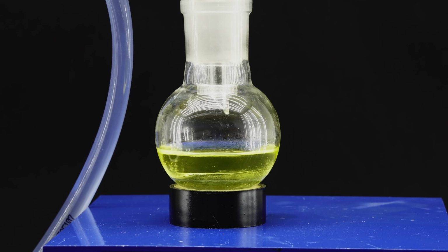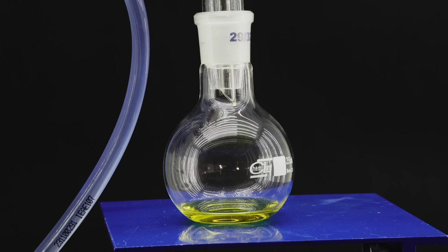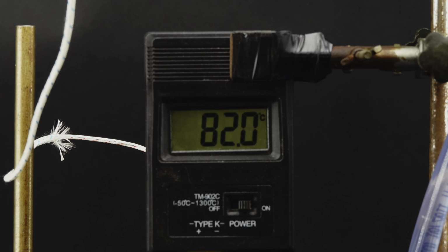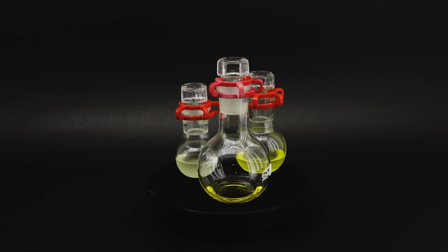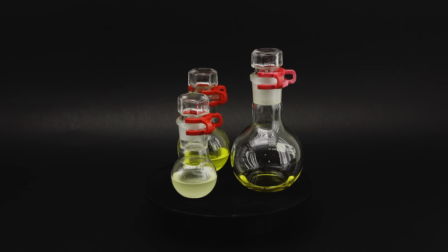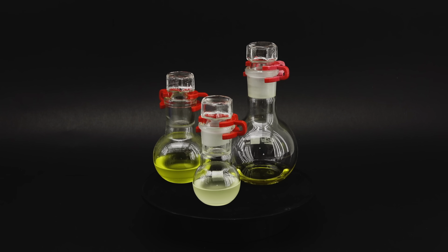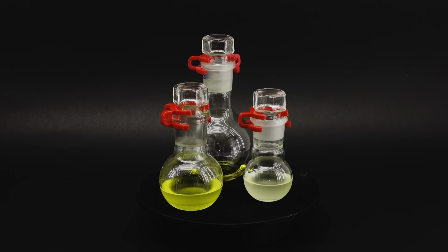For now, however, I figured that I shouldn't care and continued the distillation, changing the flask one more time. When the temperature started spiking, I turned off the heating and took apart the apparatus. This left me with these 3 flasks containing colored fractions of what was meant to be a nice colorless liquid, and since I want my benzene to be high quality, I decided to purify them all.